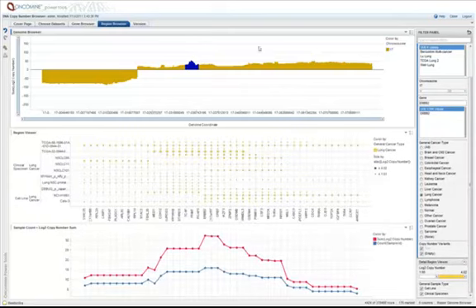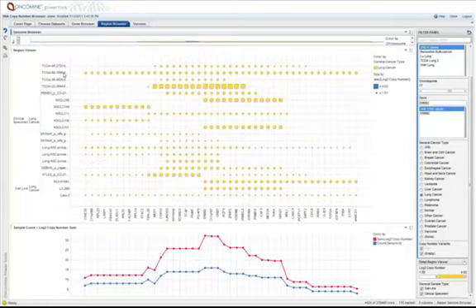So now what we have, the rows are cases, and you can see TCGA cases here at the top of the map, but cases from other studies as well. The boxes indicate gene-level amplifications. So the boundaries for a particular patient indicate the boundaries of the underlying amplification. So we can look across all the patients here. You can see the HER2 gene here in the middle. For the most part, HER2 is always amplified when the region is amplified.